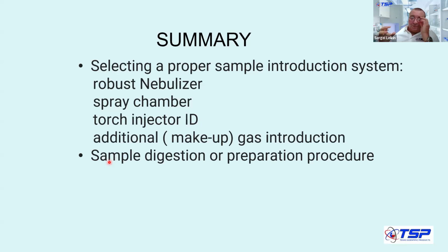If you have a procedure that involves sample prep, it can be tuned and optimized. In the case of the oil samples, I forgot to mention that these samples solidify at room temperature, so you have to heat them up. People are heating them up to loosen them and then making a dilution with a solvent.